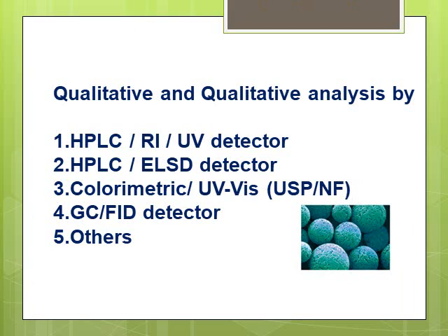For the qualitative and quantitative analysis, I'm going to talk about 4 different methods: HPLC with RI and UV detector, HPLC with ELSD detector, a colorimetric method that uses UV-Vis equipment, and GC technique.